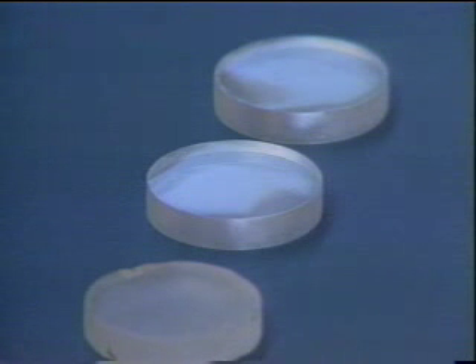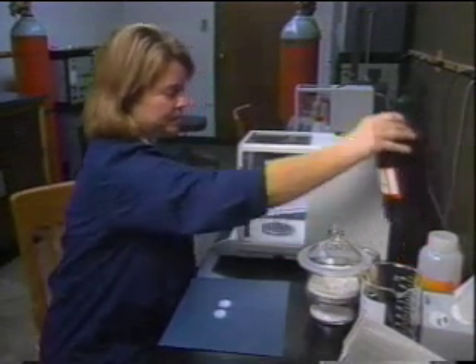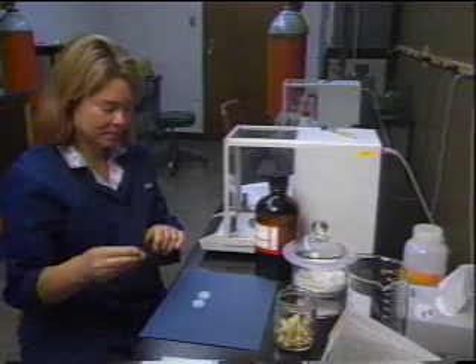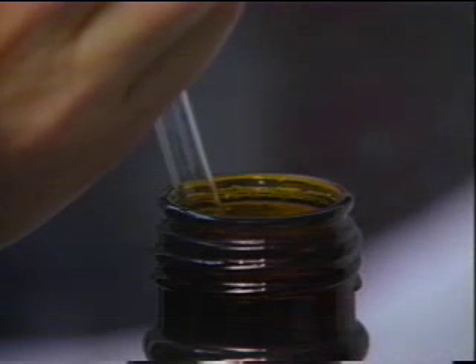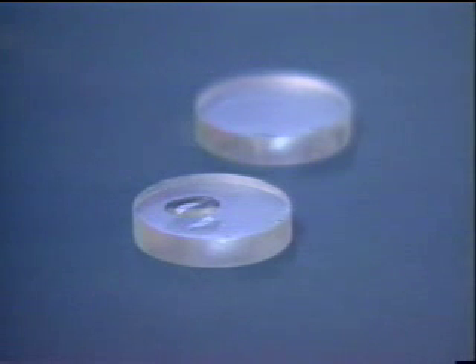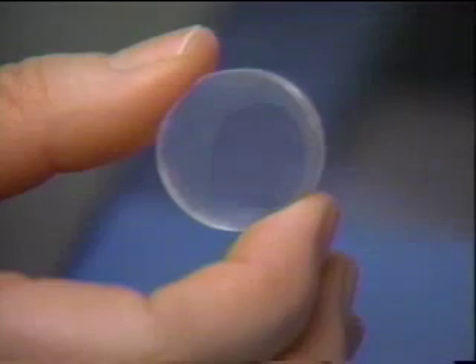Salt plates are also very fragile and break readily when dropped. To prepare a thin film, use a Pasteur pipette to drop a small amount of the sample — in this case, benzyl alcohol — on a salt plate. The plates are reversible, so there is no right or wrong side. Place another plate on top of the first and note how the liquid spreads into a thin film. The thin film should be a uniform 0.1 millimeter thick.